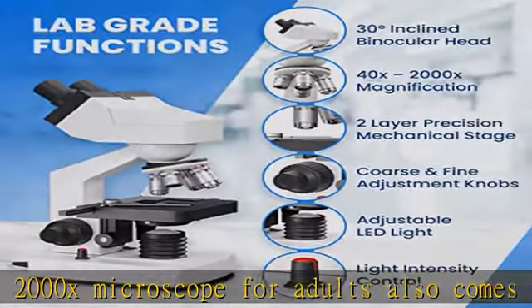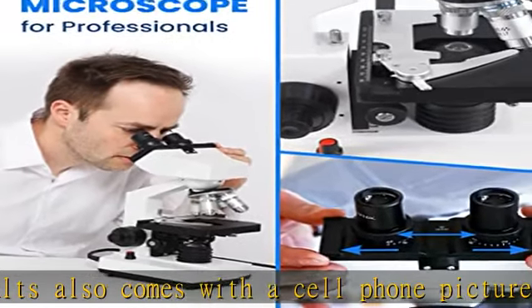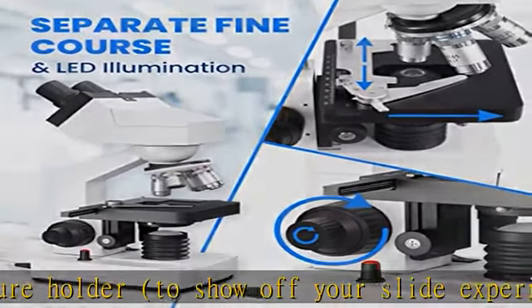Rotatable head — a 30 degree head inclination plus 360 degree rotation. The binocular compound microscope increases usability whilst engaging in scientific exploration.